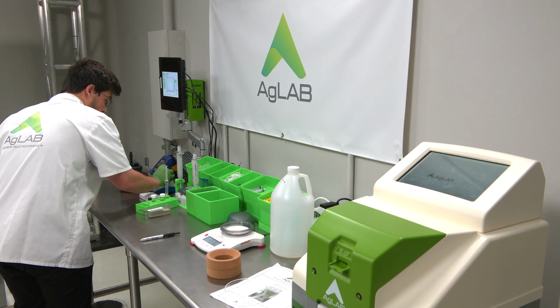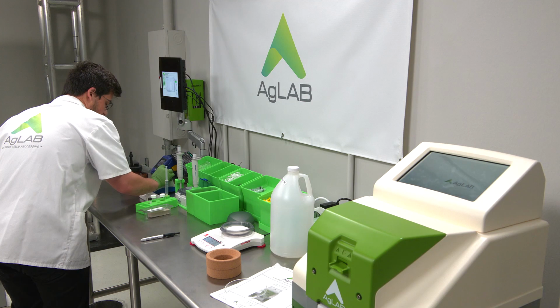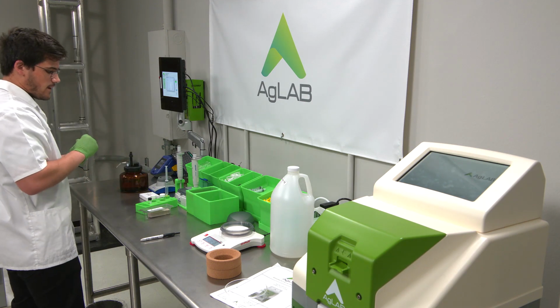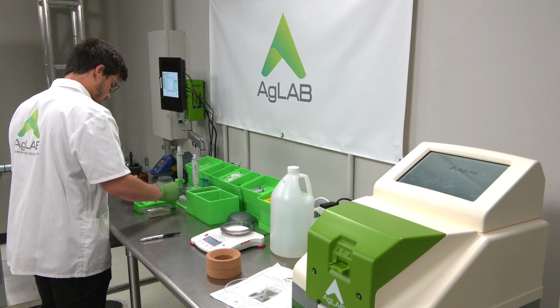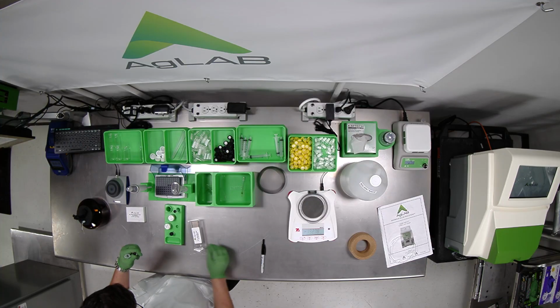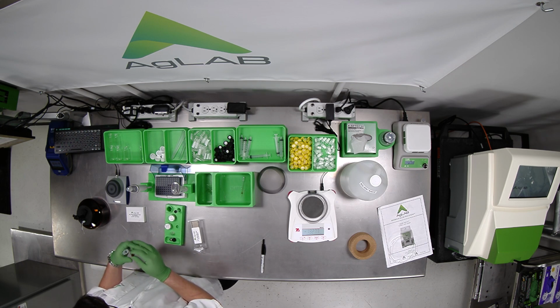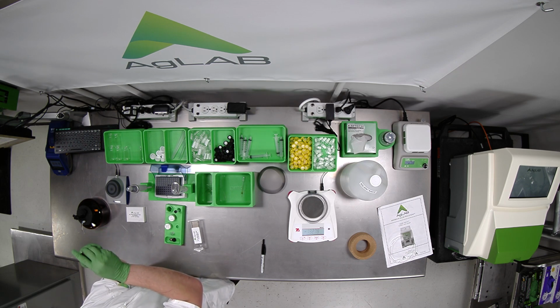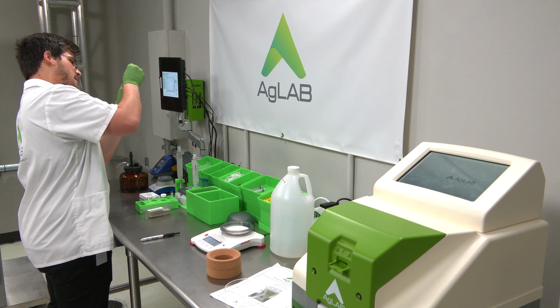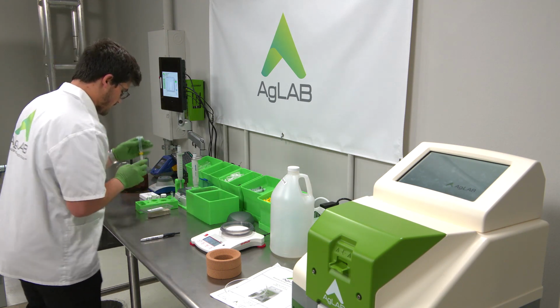I like to do a quick shake just in case any solution happened to get on the cap or anything inside of the vial. So that's fine. Now we're ready for our filter. So pull this cap off and have everything ready as soon as you get your solution into the syringe. It's going to take a couple taps. The solvent that's used in this vial creates sort of a tension bridge in the vial. You have to tap it a couple times to get everything out.